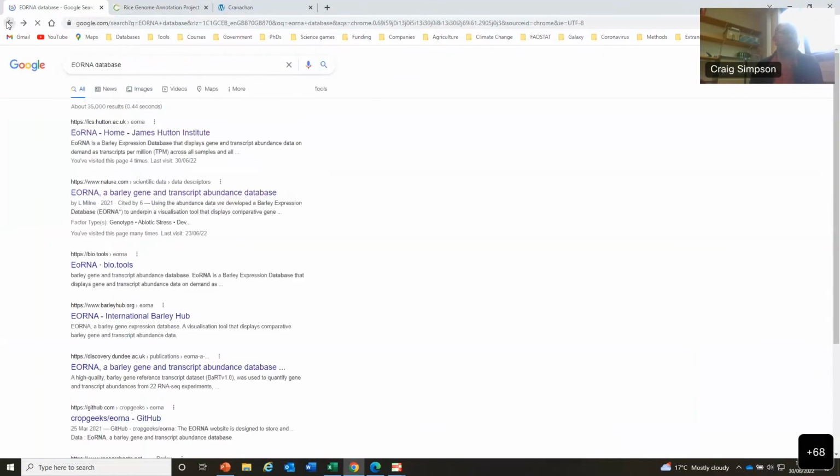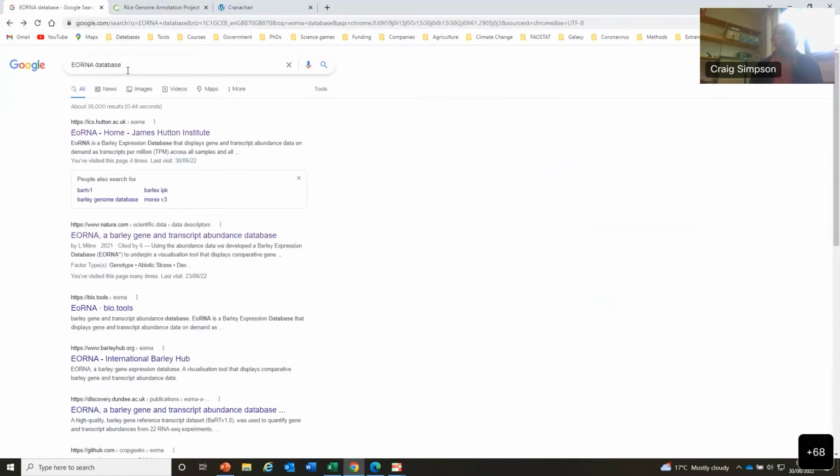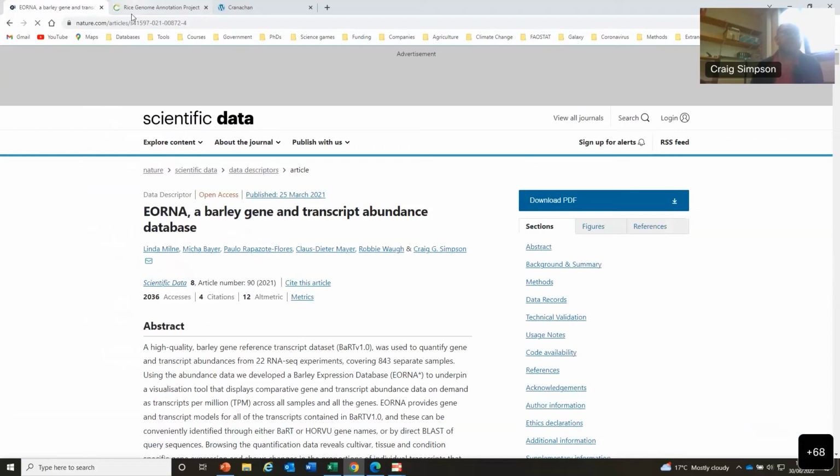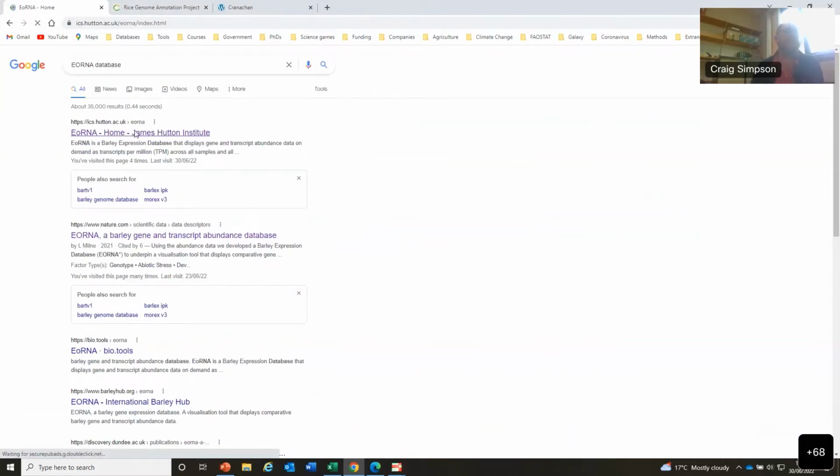And then I can go to BART. If I just type in EoRNA database, I can then find the EoRNA Barley Gene and Transcript Abundance database, and we can go straight to this. That's not what I wanted to do. I want to go here. Sorry.